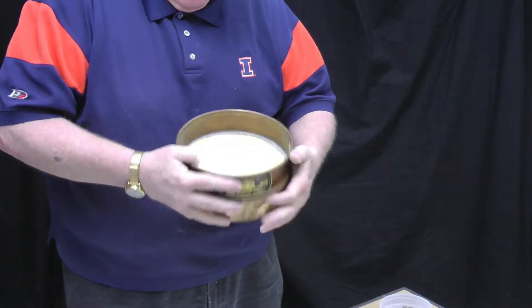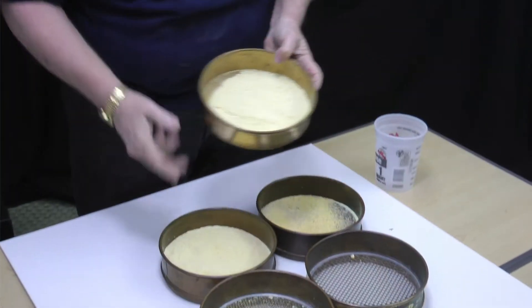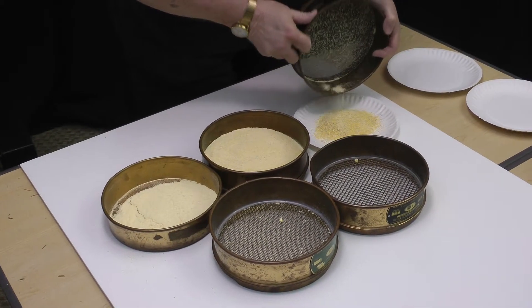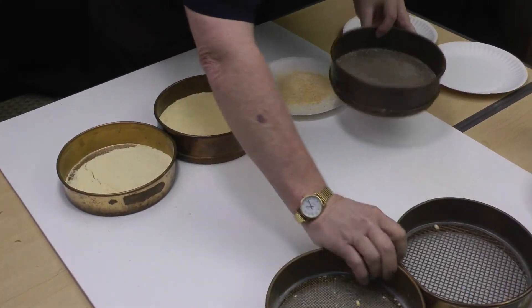The last screen catches the flour — that really is corn flour particle size that you could actually bake with. Next we're going to dump each of these fractions into paper plates and weigh them on a scale.